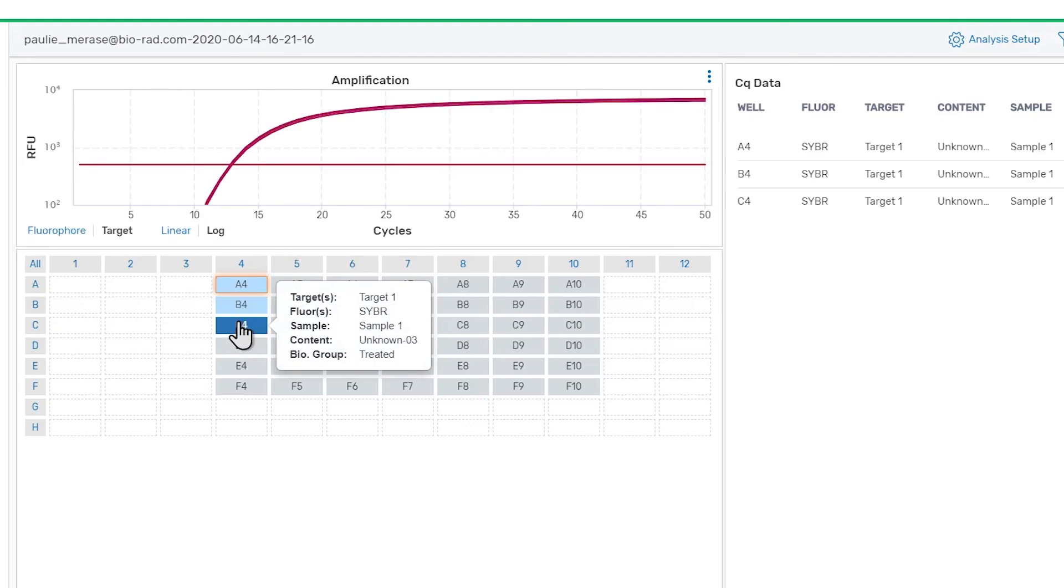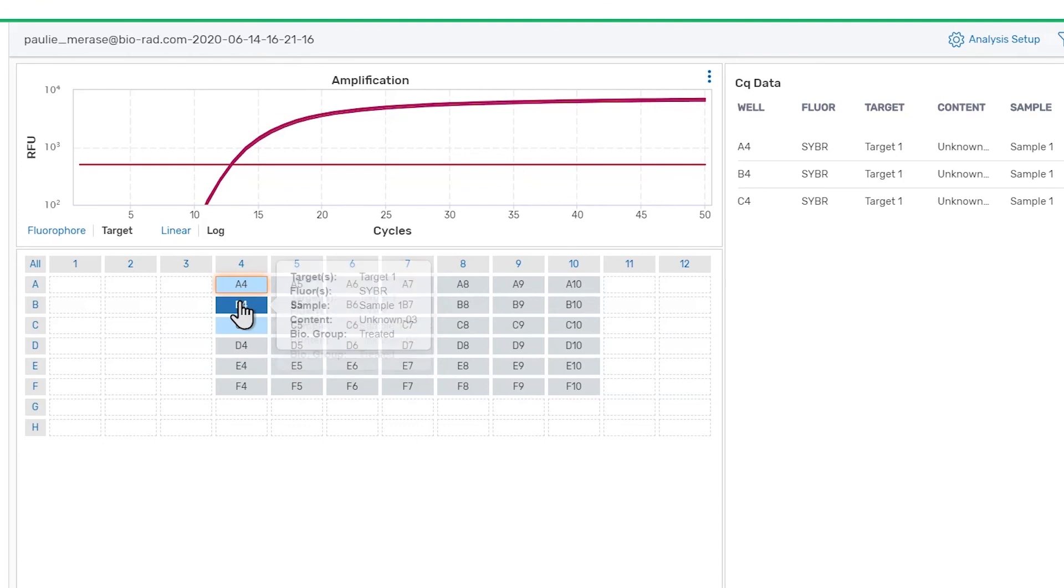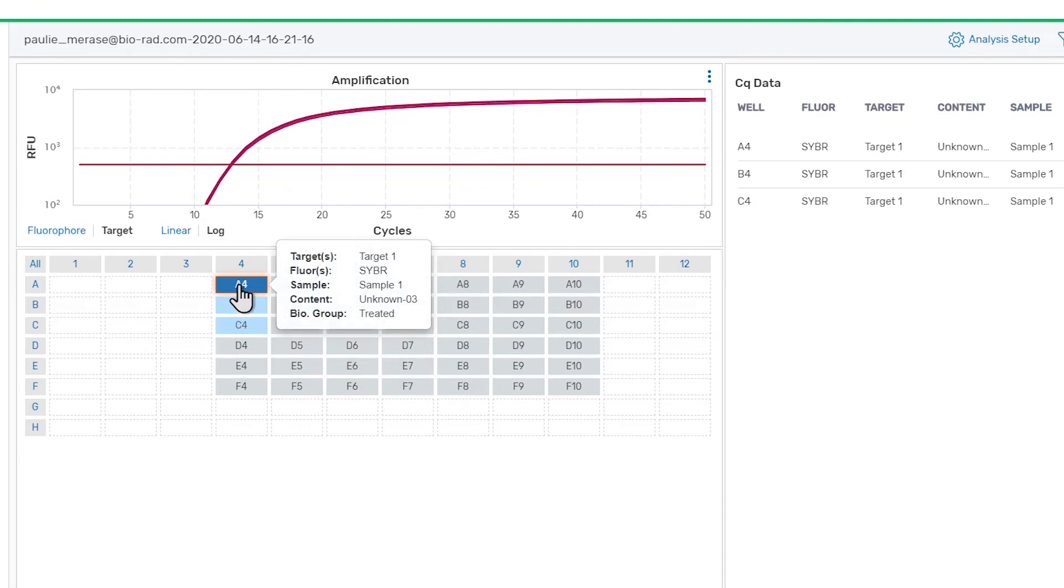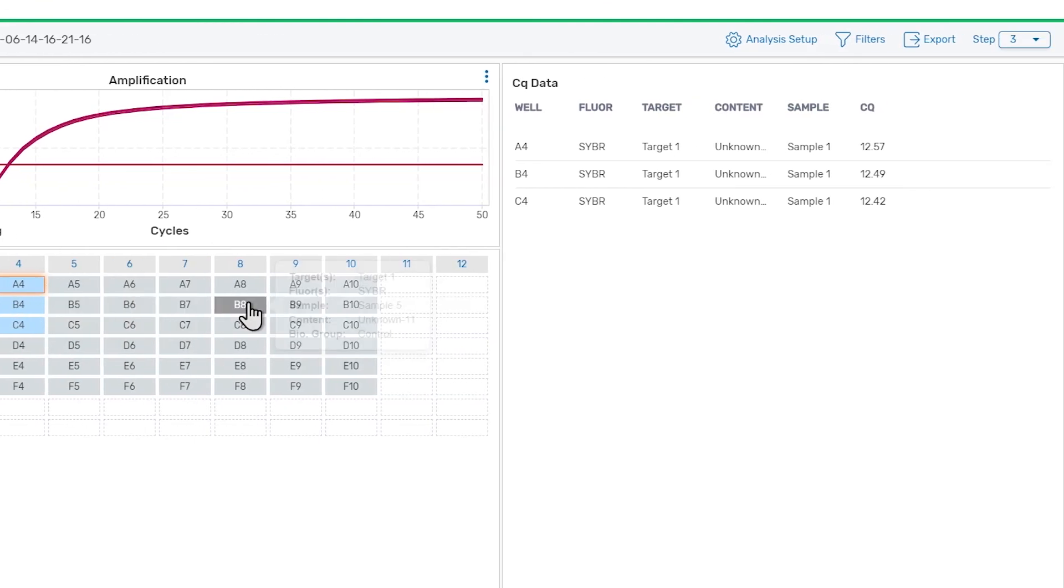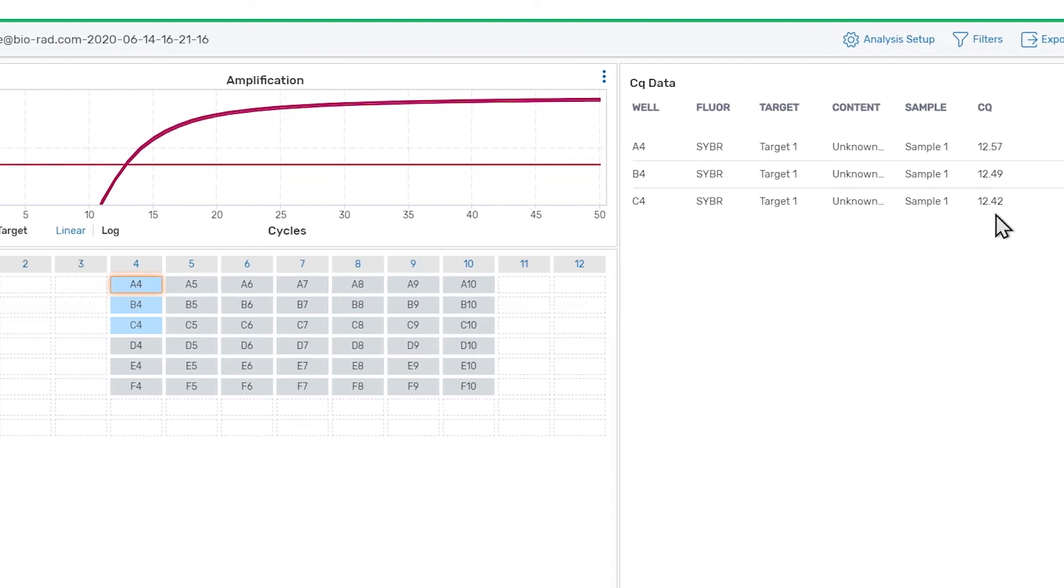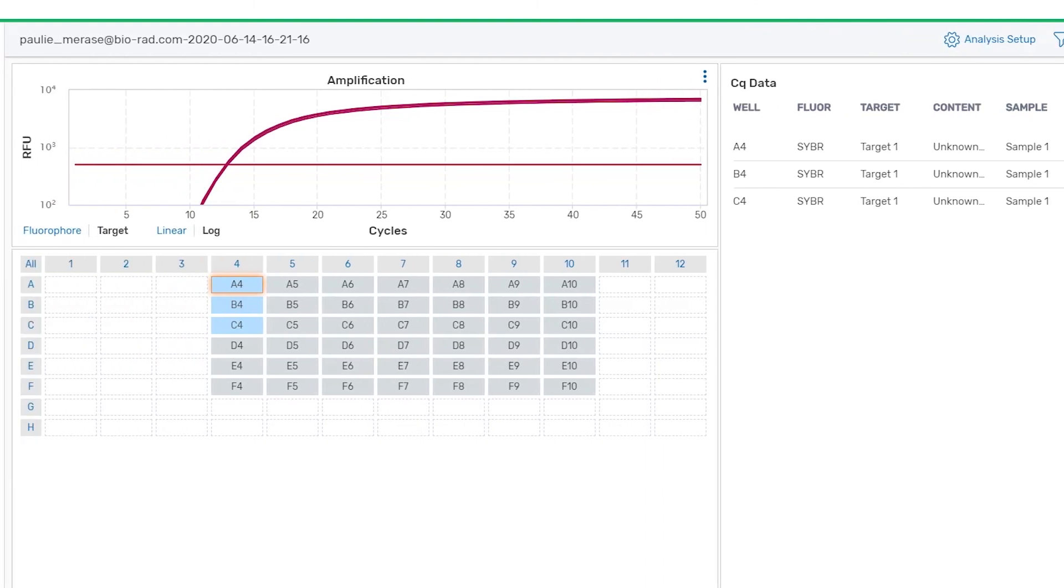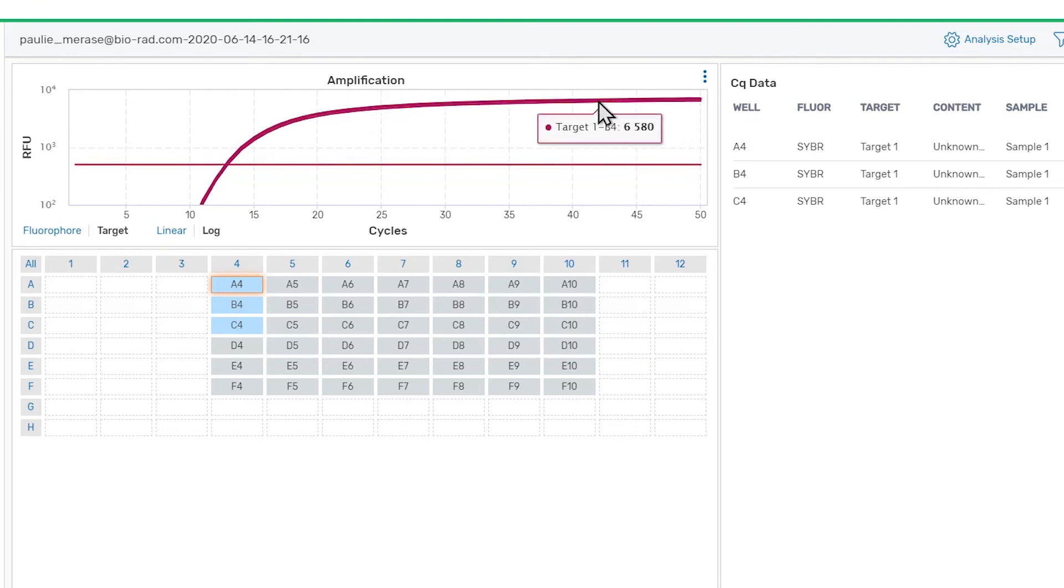As you're reviewing the data, you can hover your pointer over a well to inspect the contents, you can view the CQ values on the data table, and you can hover over traces on the amplification chart to view the RFU values at particular cycles.